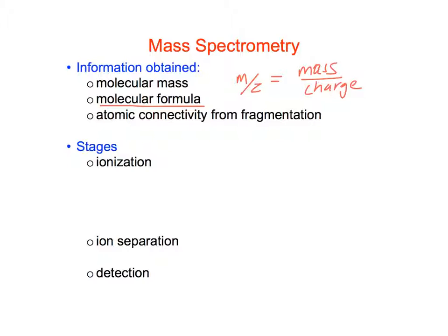And then once we have generated this, we oftentimes get some information about connectivity of atoms based upon how the molecules break apart in the mass spectrum.